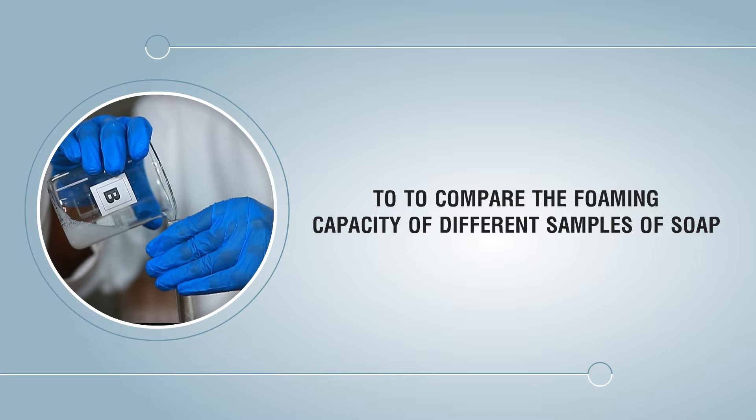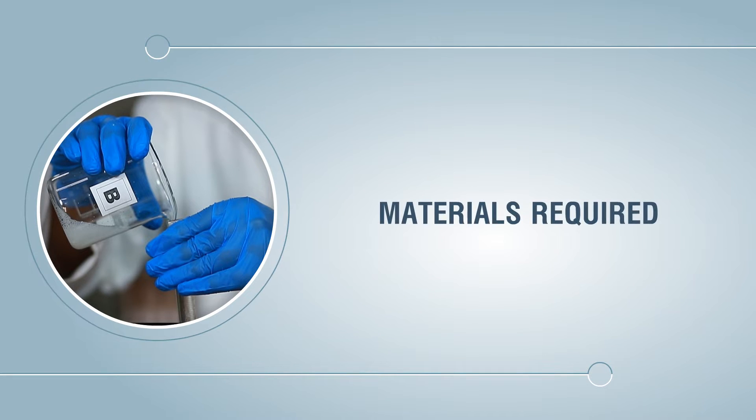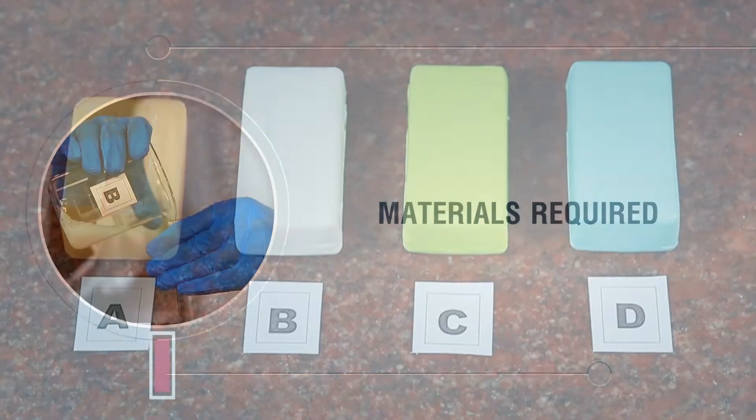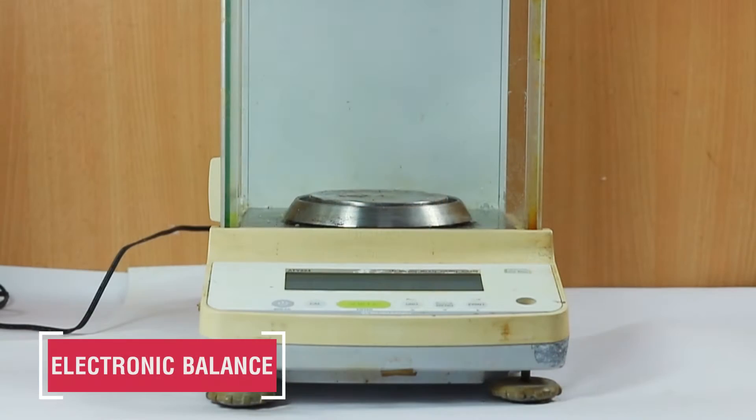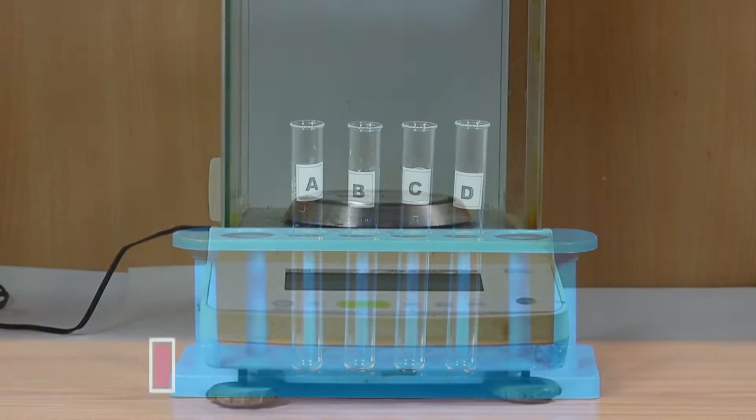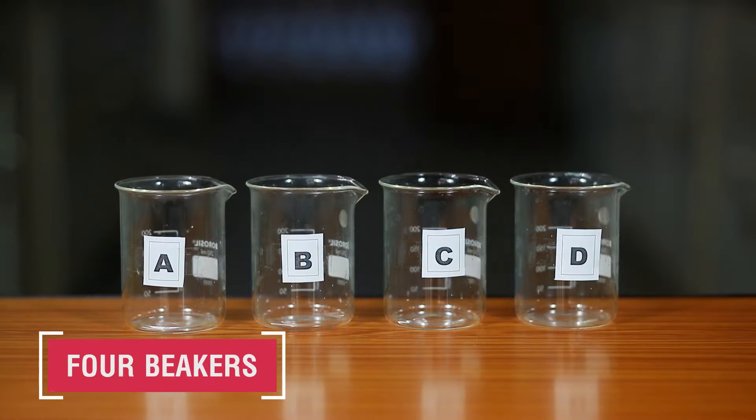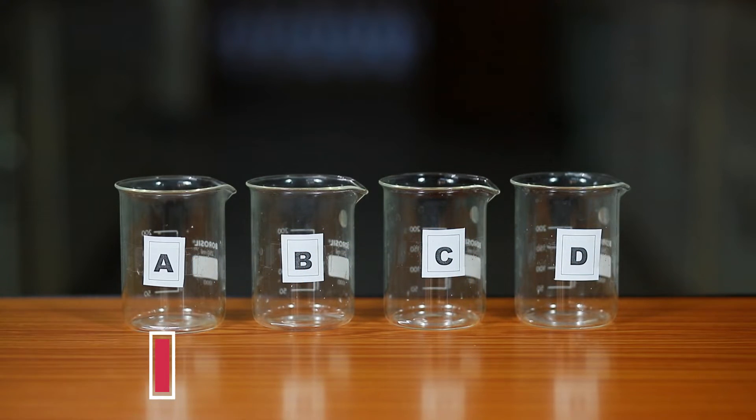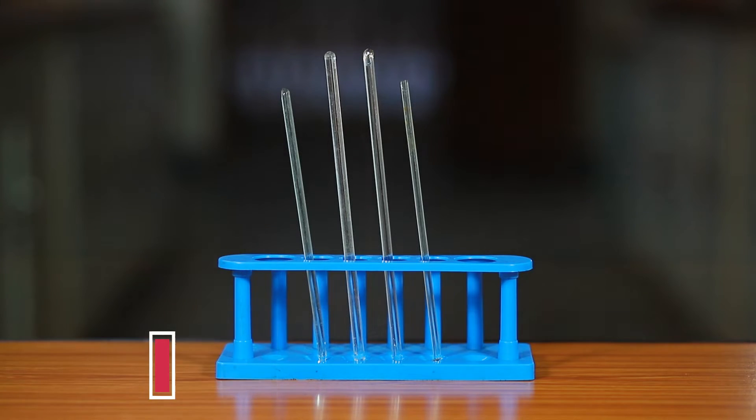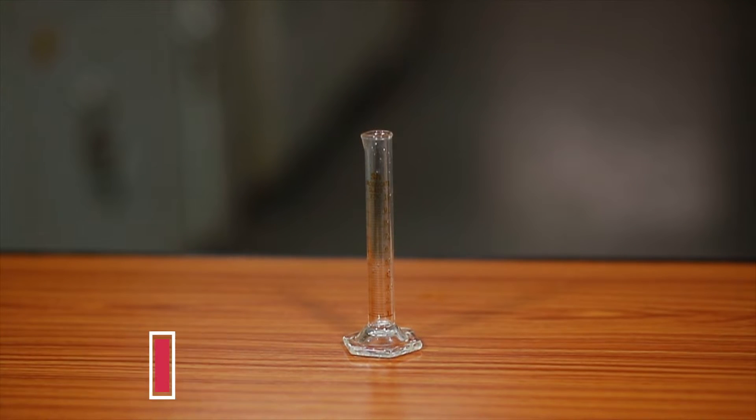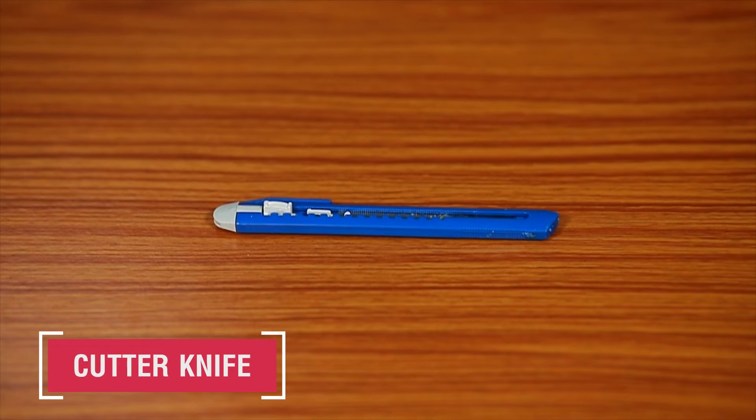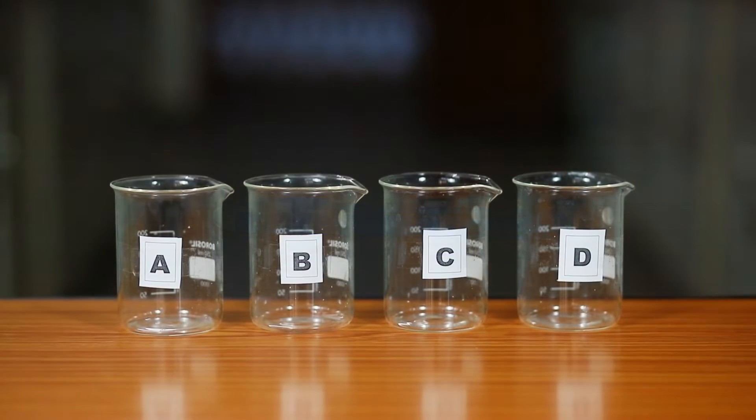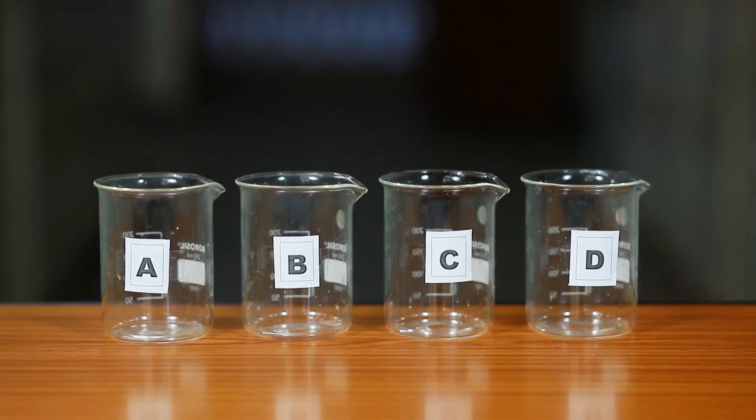To compare the foaming capacity of different samples of soap. Materials required: different samples of soap, distilled water, electronic balance, four test tubes, four 100 ml beakers, four glass rods, a measuring cylinder, a measuring scale 15 centimeters, and a cutter knife. Take four labeled 100 ml beakers.